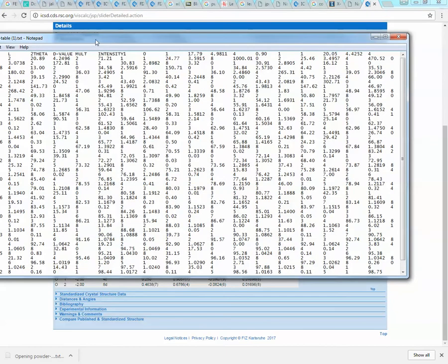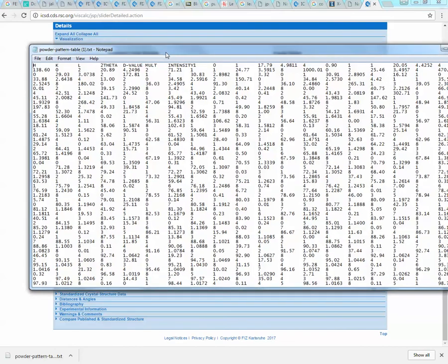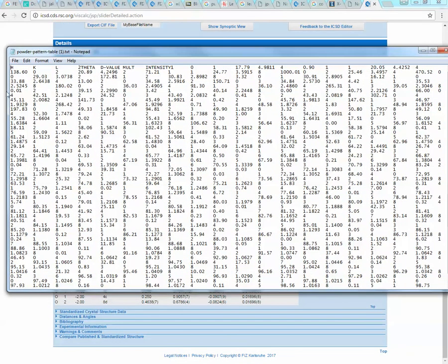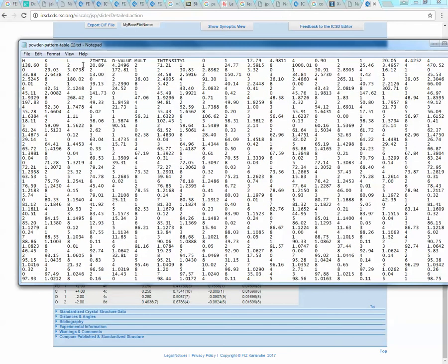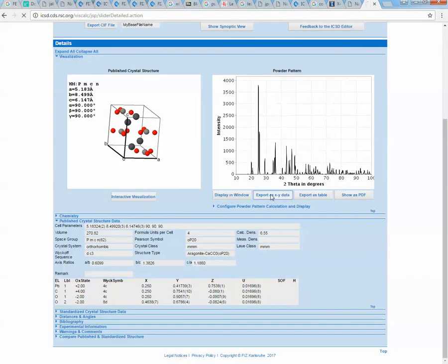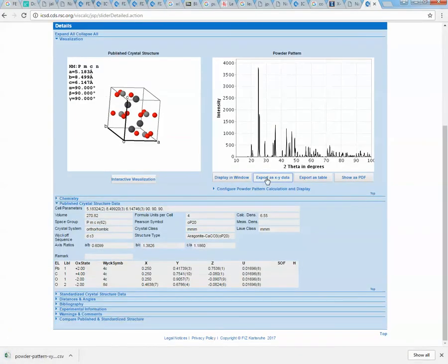Just say, does it give me the HKL? Yes, actually. It's not in a very useful format, but because HKL here, it's opened it as Notepad. I wonder what would happen. It looks like you need to open this table. It will tell you what the HKL values, Miller indices are, but you need to open it in something else and not in Notepad. Show in folder, open with WordPad. Okay, there we go.